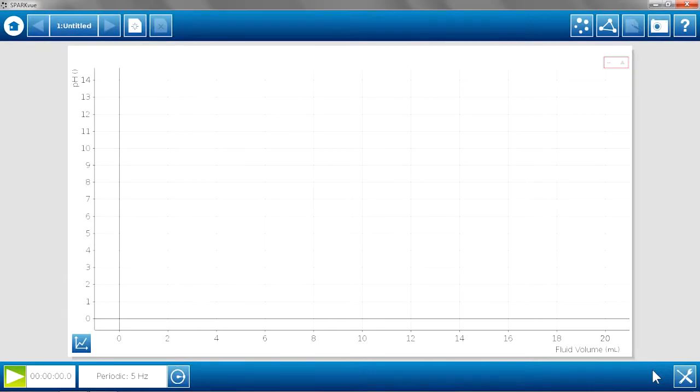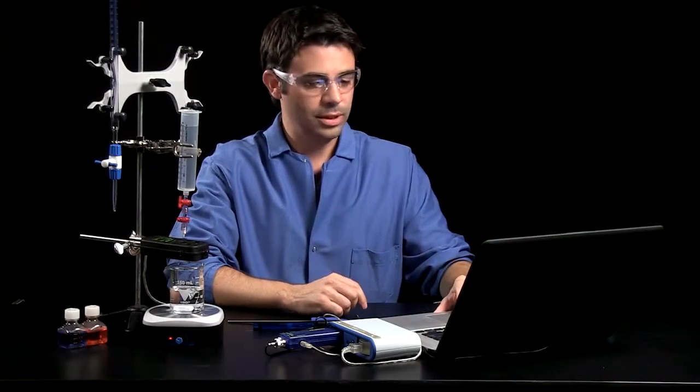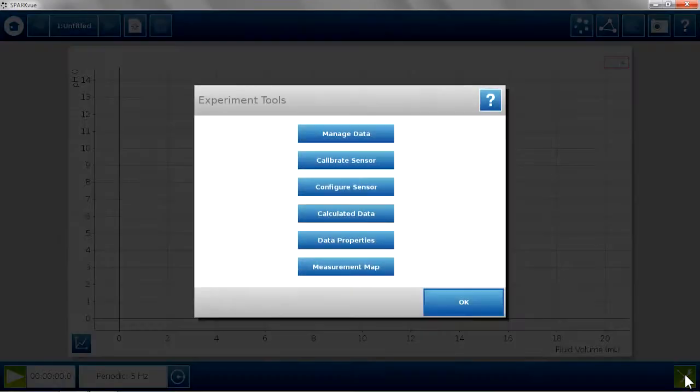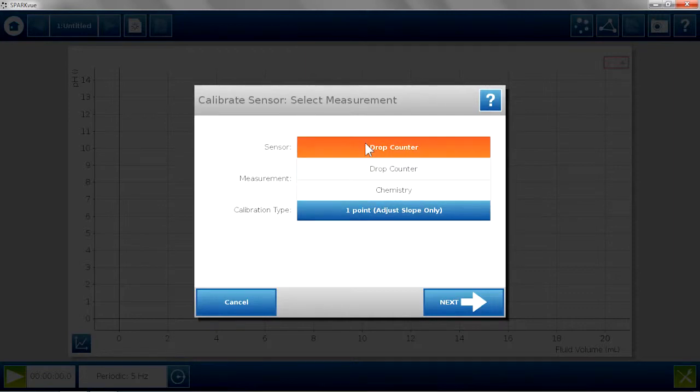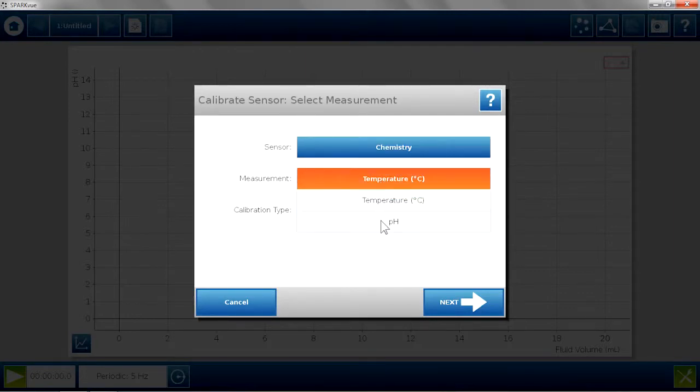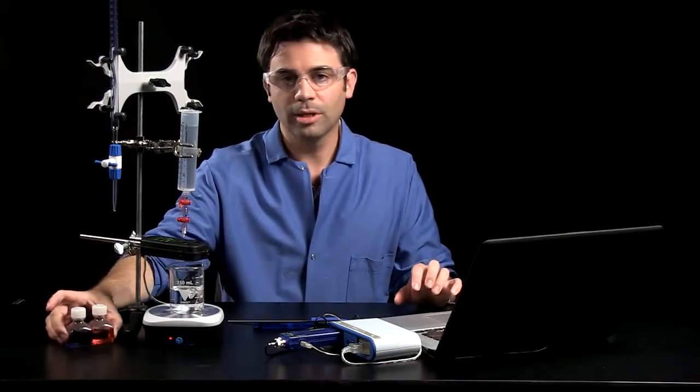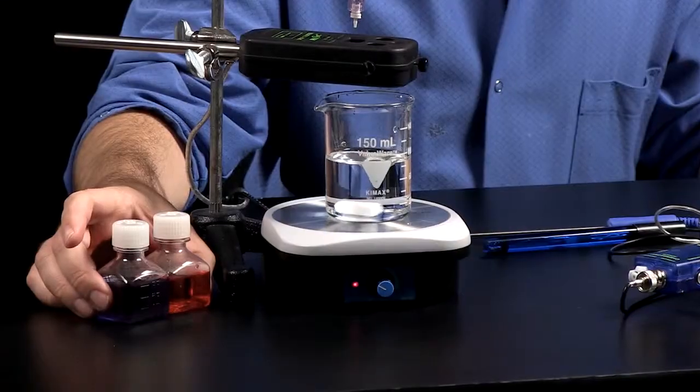Now with any titration, you want to do some calibrations beforehand. You want to calibrate the pH meter, and to calibrate in Spark, you go to the tools, and you can calibrate your sensor. In this case, I can calibrate my chemistry sensor and my pH. Now I already pre-calibrated this with my buffers 4 and 10.